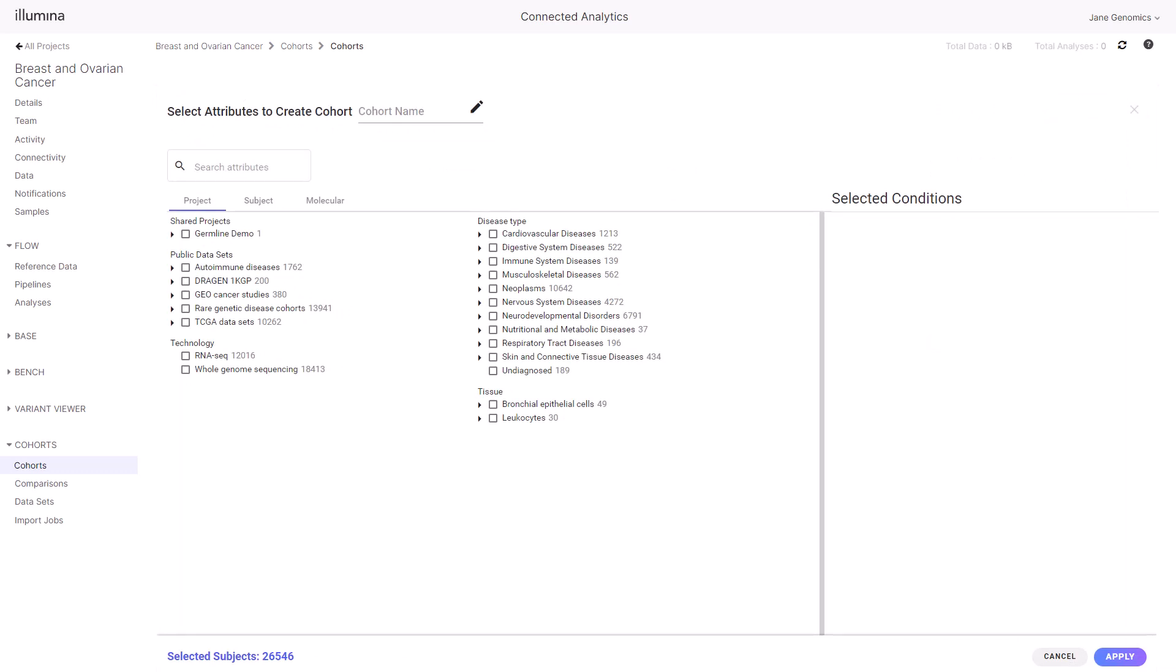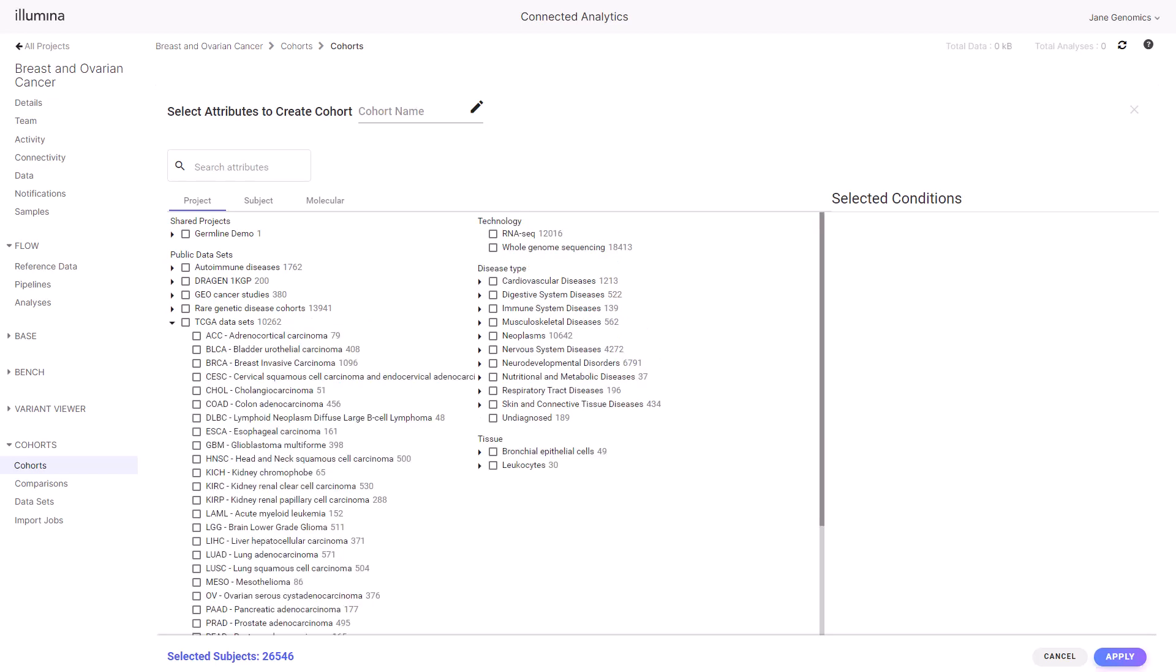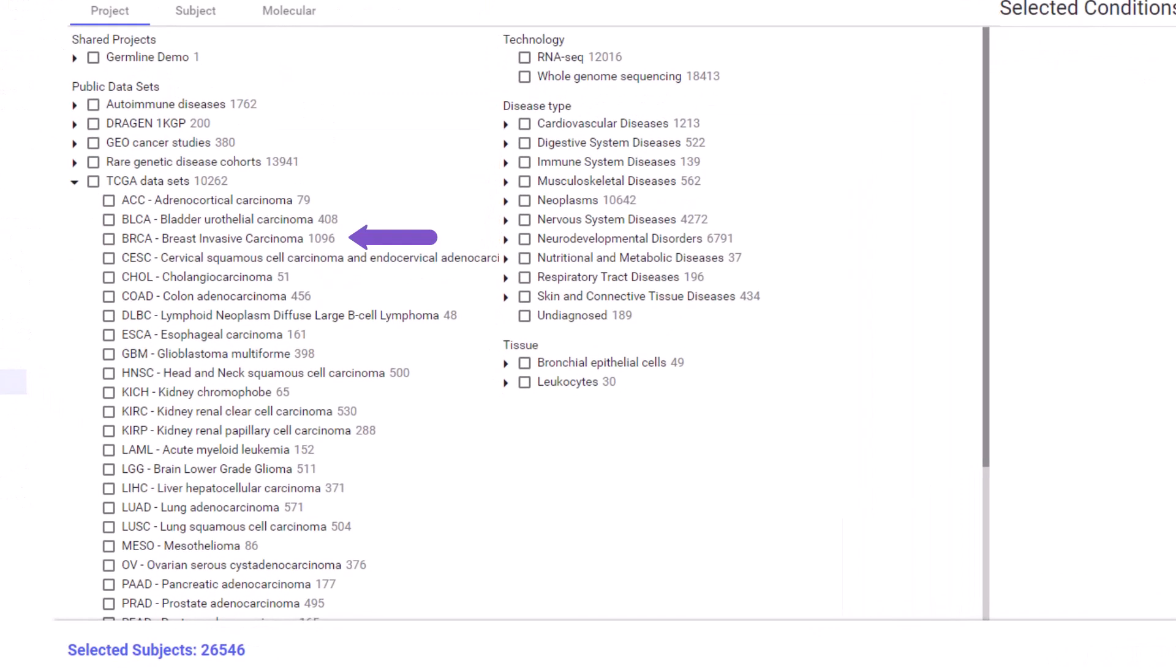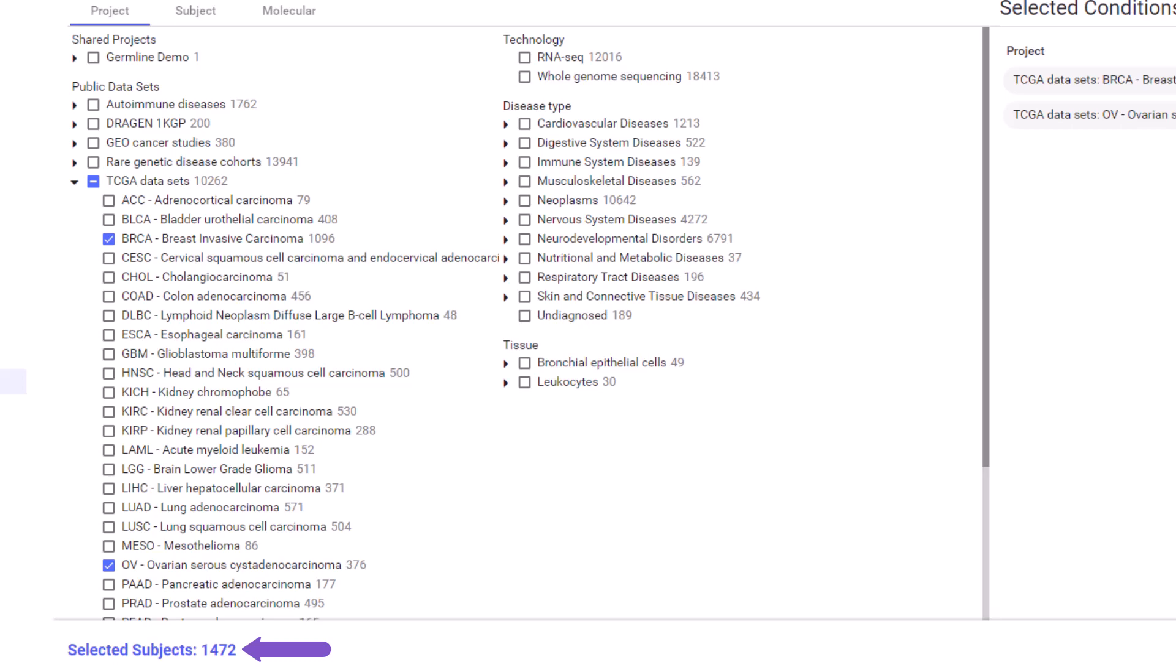Private data can be imported, but for this demonstration we will use the curated public datasets, specifically the Cancer Genome Atlas datasets: BRCA breast invasive carcinoma (note the number of participants), and the OV ovarian serous cystadenocarcinoma studies, for a total of 1,472 selected subjects.